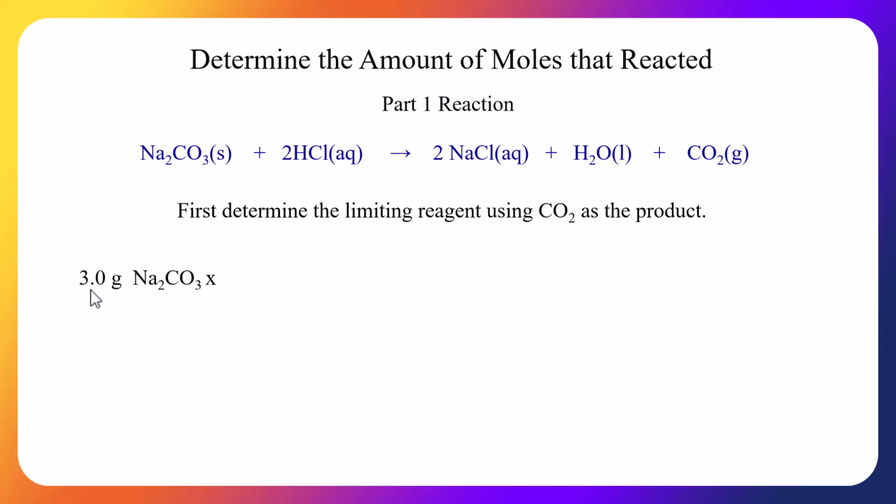Okay, I weighed out 3.0 grams of this sodium carbonate. I divided it by its molar mass. The molar mass is very simple to calculate. You just add 2 sodium, 1 carbon, and 3 oxygens. Now, this first step, I'm at moles of sodium carbonate.